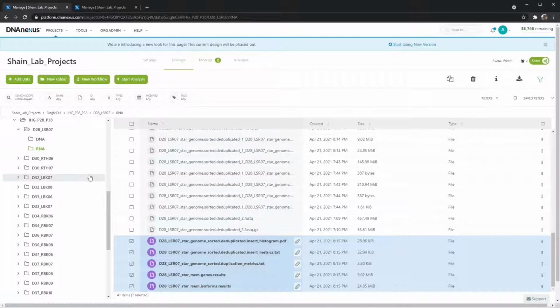So that's it. That's how you'll run these workflows. Generally, this will take a while, so it's best to make sure that we get our money's worth and do this correctly. So again, make sure you double check your files. It's very easy to lose track of where exactly you were, what sample you were doing. You might miss a sample. So it's best to be as cautious as possible.